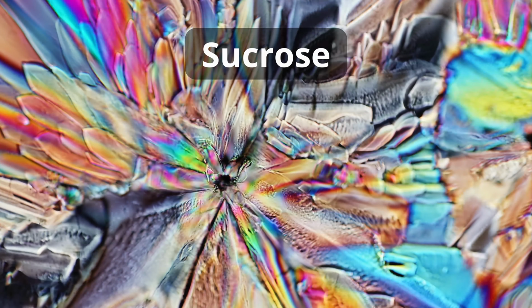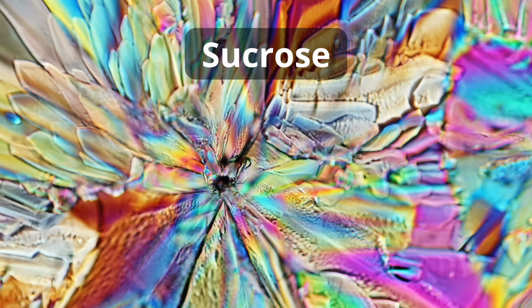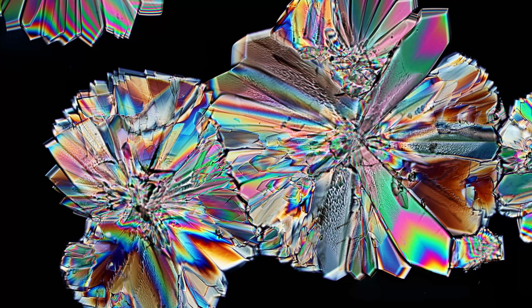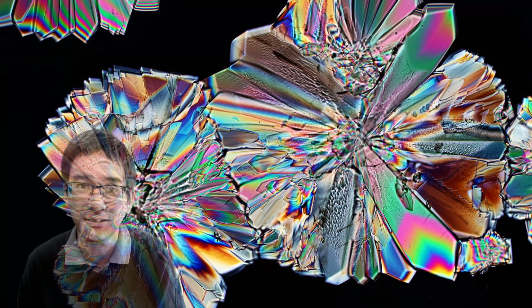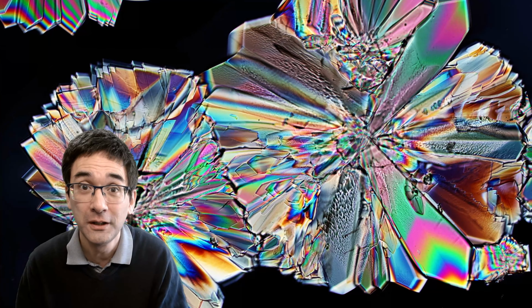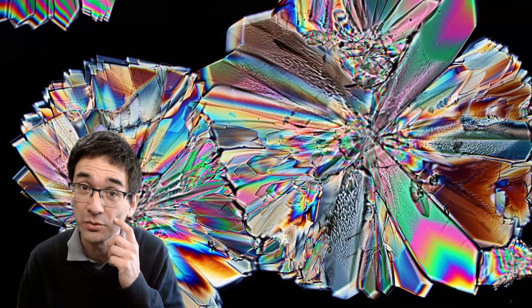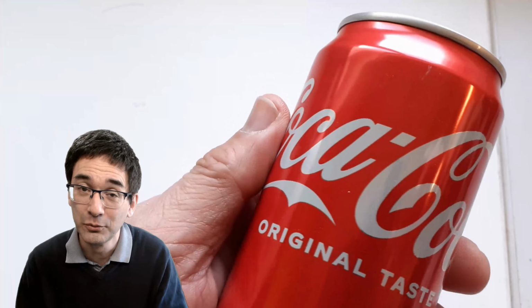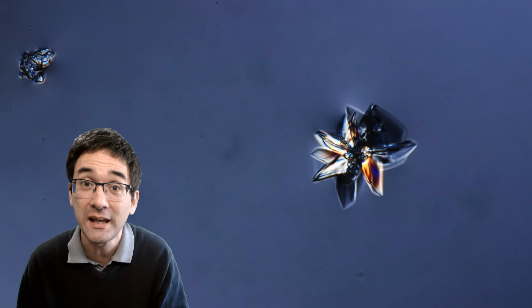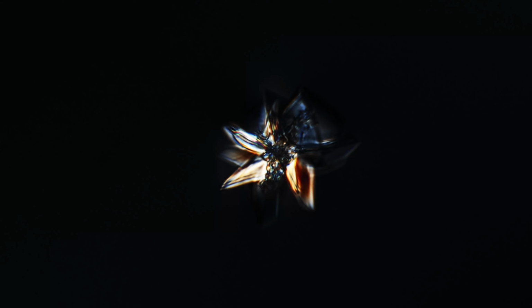And those nice color changes, this is because I was twisting and turning a knob on my microscope, and this shifted a prism around, and this has given a very nice color change here. So this is what I expected, but this is not what I got. So I looked again at the Coke can and was wondering, well, maybe I'm really not successful, and I was also wondering why this could be the case, and later on I'm going to show you some suggestions on how you can improve that.